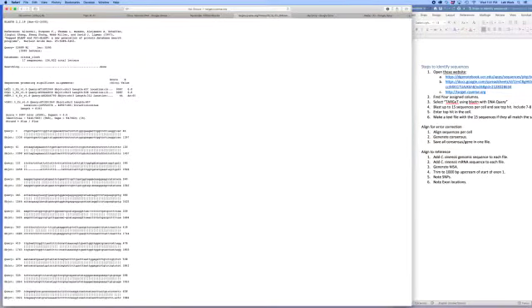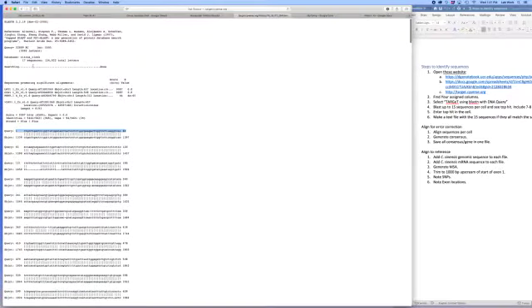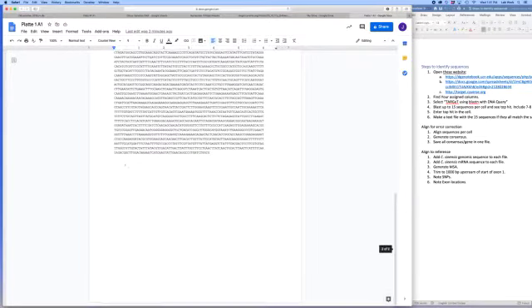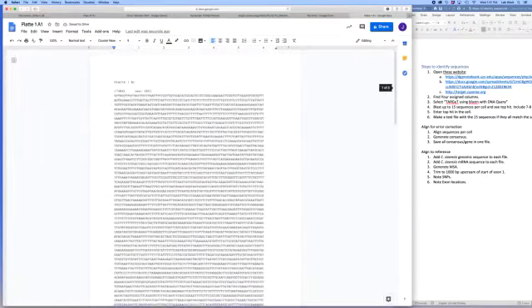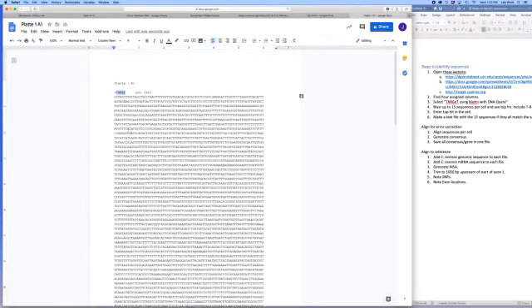Again, we get LHY, CCA1, very high scores, excellent. And again, we see that the query starts and is going up, so that means it's going in the correct way. So I managed to finally get all the bugs worked out, and all the sequences here are going in the same direction. We don't have to worry about some being a forward sequence and some being a reverse. Okay, so we verified that one, so we'll go down here and paste it in. And when you do this, of course, make sure you have the comment that this gives us back the original sequence that came off the sequencer. So we need to document that.